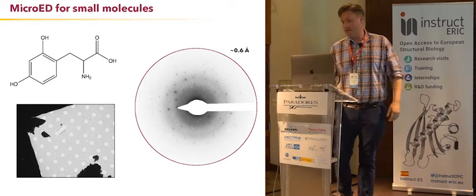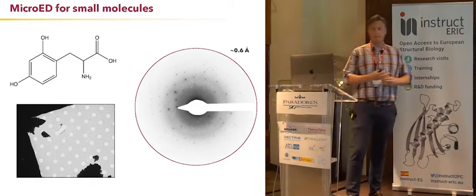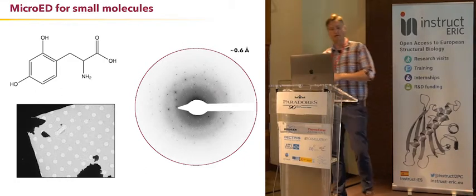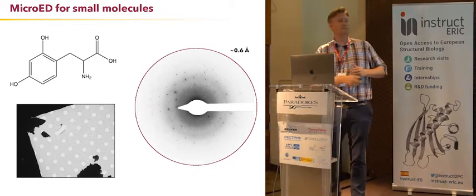Another quick story, just again to show you how this works and how useful this could be. A friend's lab, he's in the biochemistry department, he's a friend of mine, he does unnatural amino acids. And so we're trying to make this unnatural amino acid right here.